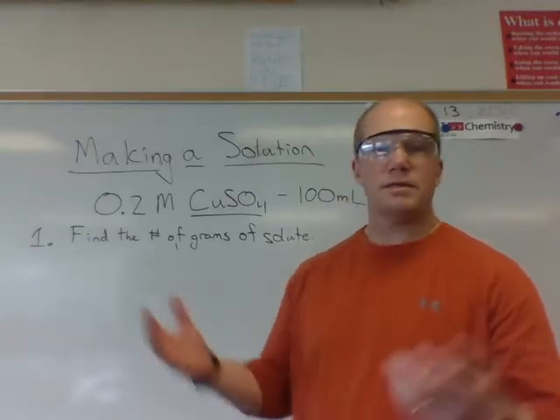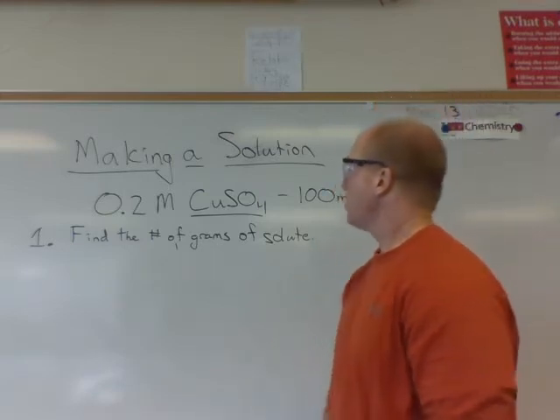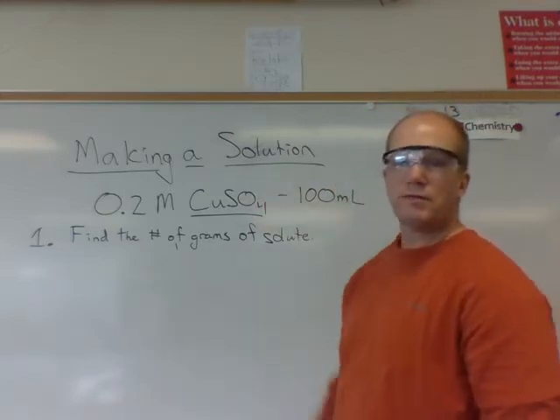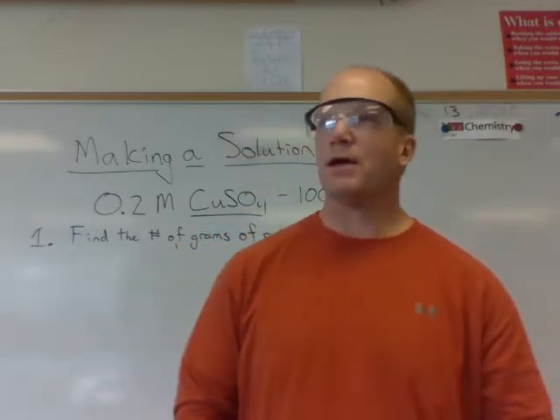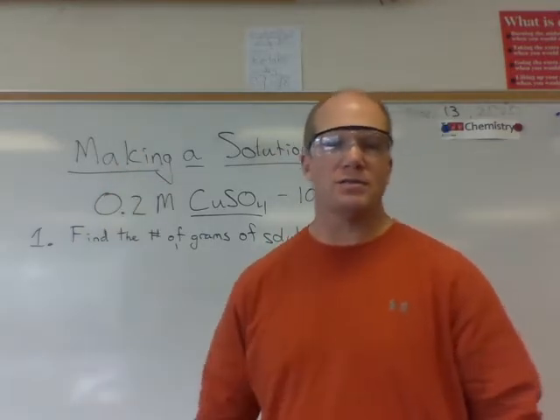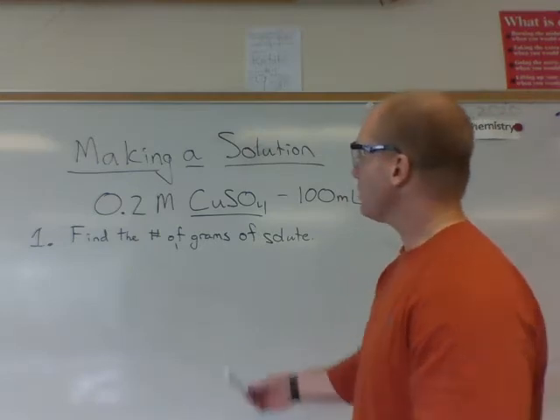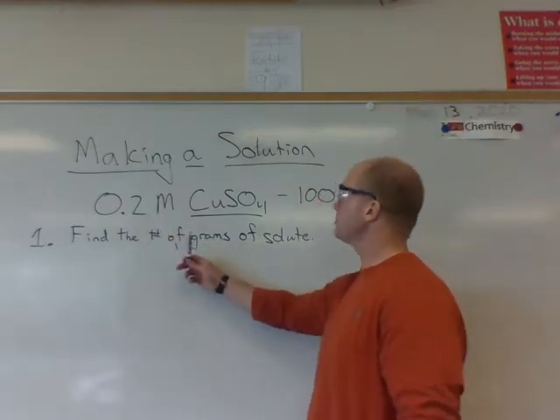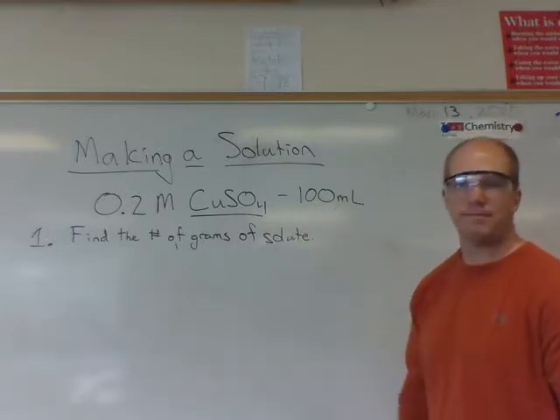And so I'm going to demo some stuff for you guys, some real chemistry. So we're going to make a solution. And if we were in class, I would have you do this. So hope that being in my classroom brings back some good memories. Maybe you can visualize where you sat and stuff. But yeah, so we're going to do this today. We're going to make a 0.2 molar solution of copper sulfate. And we're going to make 100 milliliters of that.